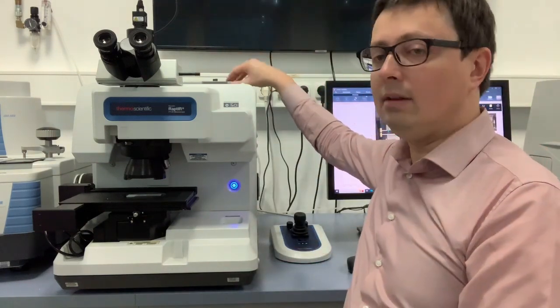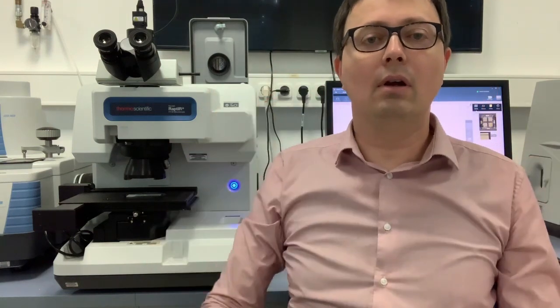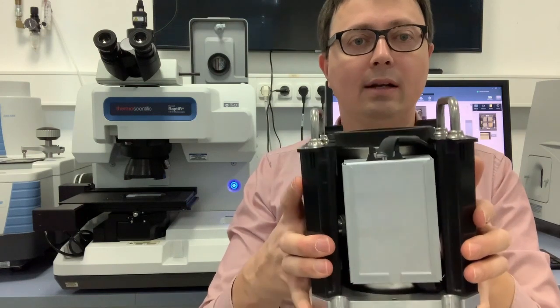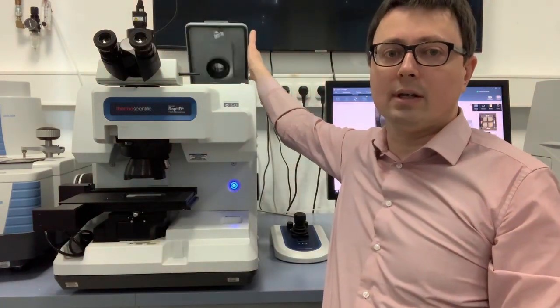You simply open the cover in the back, pull out the detector, and insert the new detector. All the electronics are integrated together with the detector. You just take out one detector, insert the next one, and the system will automatically recognize that you have exchanged the detector.